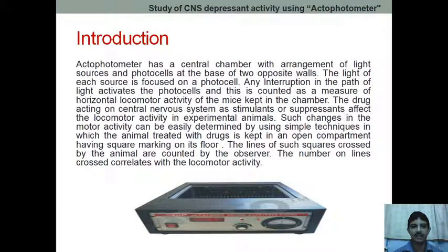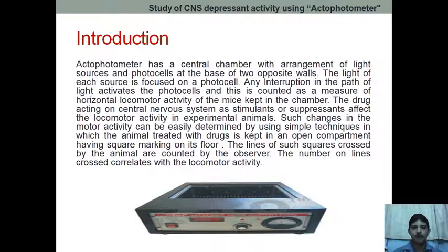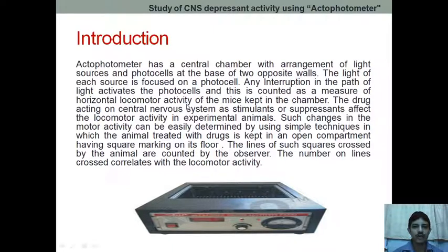Whenever we keep the animal inside, it will move in one direction or another. As a result, it will interrupt the path of light, meaning the light will not fall on the photocell and it will be counted. So if the movement is more, the count is more; if the movement is less, the count is less.